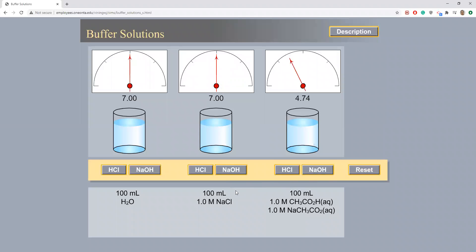Lastly, we will work with the acetic acid and sodium acetate buffer solution. An addition of 10 milliliters of 1 molar HCl solution results in a pH change from 4.74 to 4.65. An addition of 10 milliliters of 1 molar NaOH solution results in a pH change from 4.74 to 4.83.